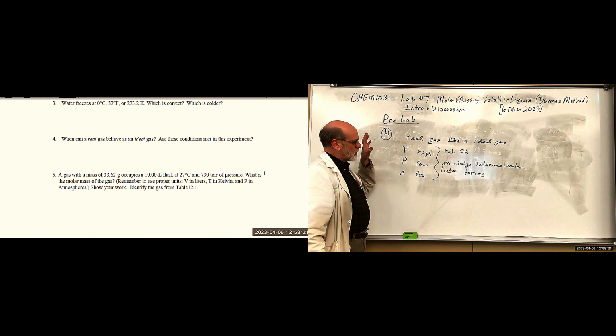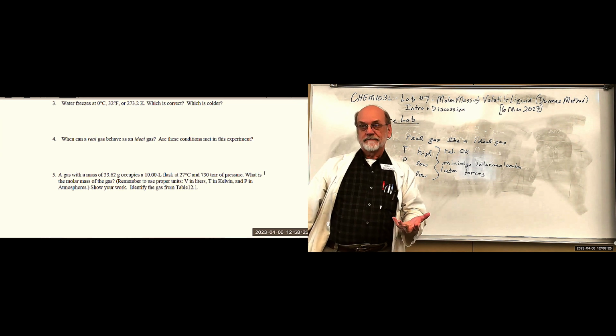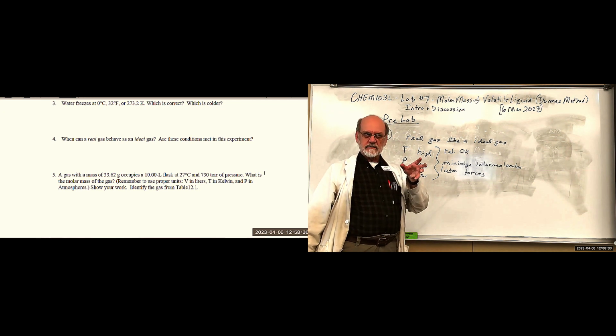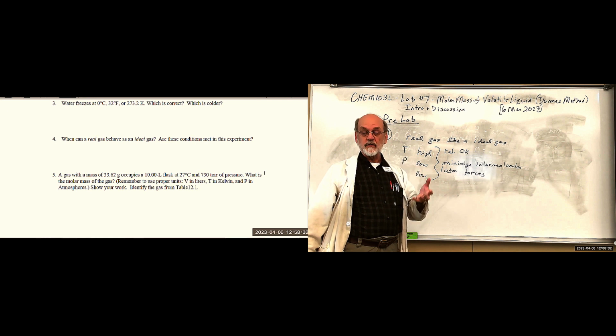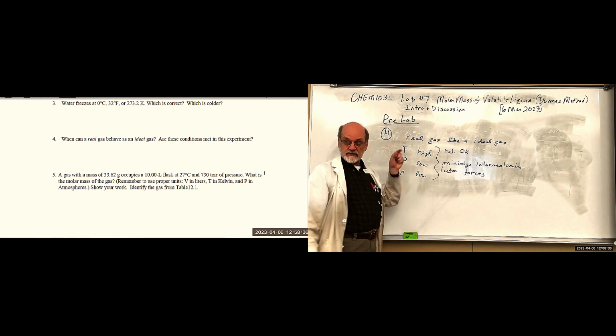Now, this is for gases that are gases at room temperature. We've got a little bit of a tweak to our situation because these are liquids at room temperature. We're heating them up, so we're adding temperature, and that's good for ideal behavior.